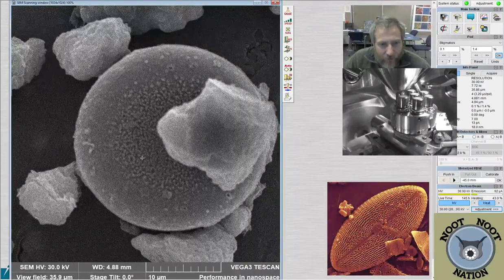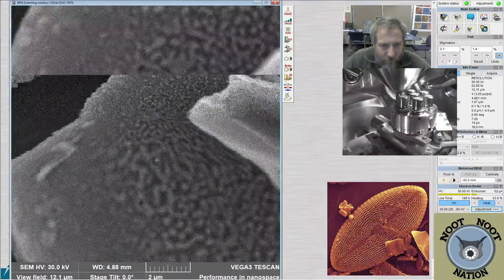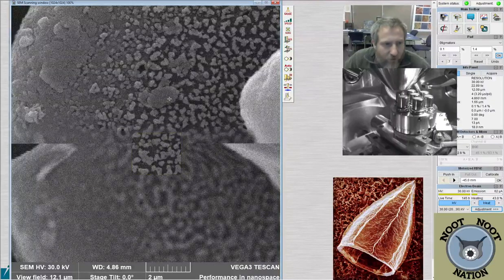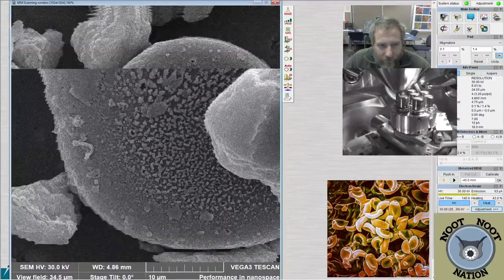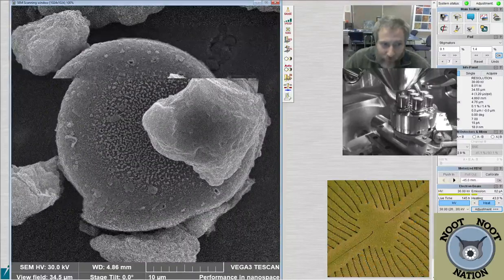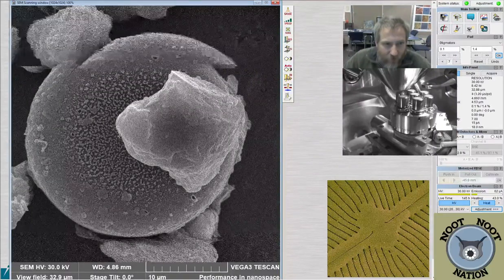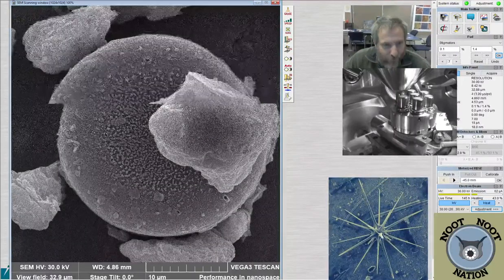This is an interesting diatom. It's got, again, a boulder on the surface. But I think we could still use this as an image. I'm going to just get it into focus for us. Oh, it's got a lot of clay. I think it's Melosira. In our samples, it's probably Melosira varians, which is the only one that I think I've seen in Indiana. It's just under one of these silt boulders.